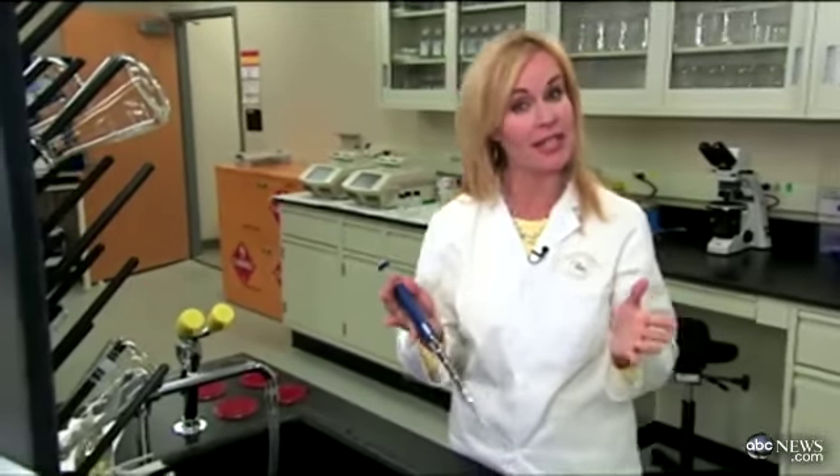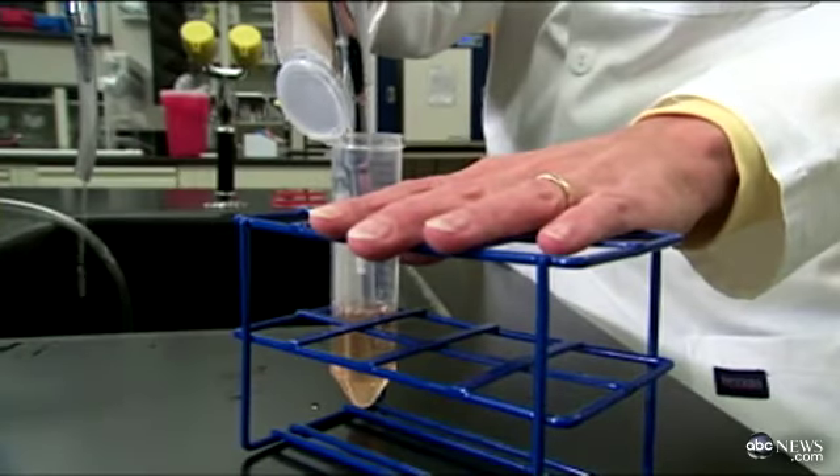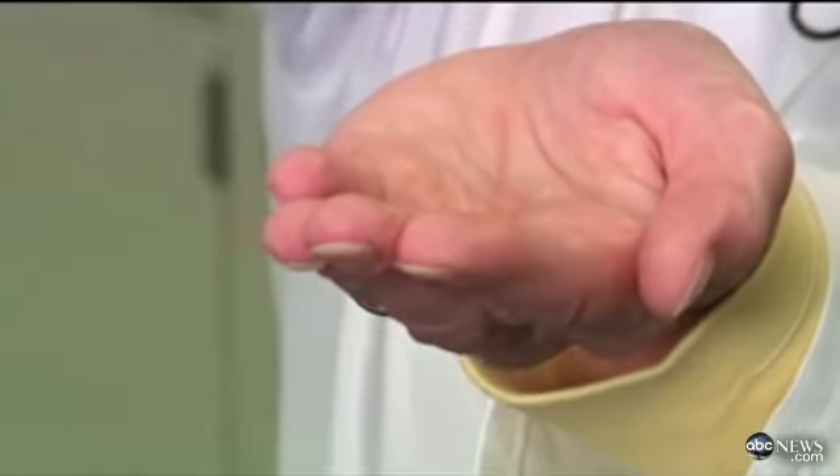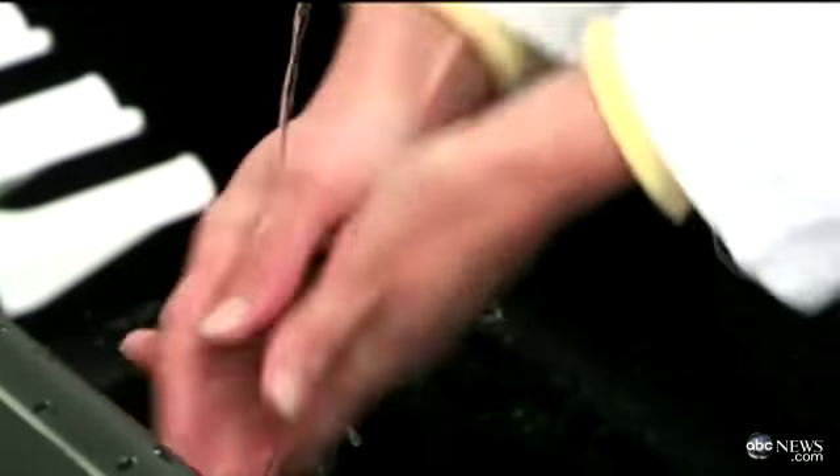The root of the problem is bad hand washing. So I came here to the University of Maryland's Food Safety Laboratory to prove a point. I'm going to put E. coli bacteria all over my own hands, and then wash for just seven seconds with no soap, because studies show that's exactly what most Americans do.